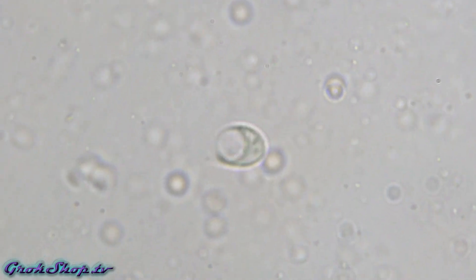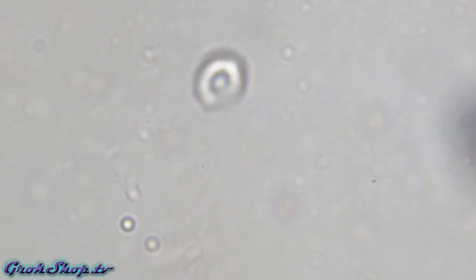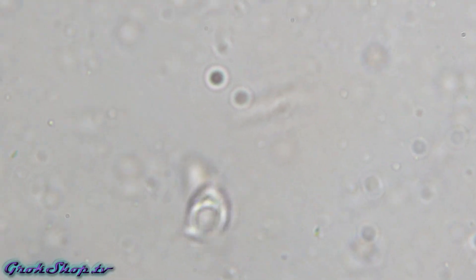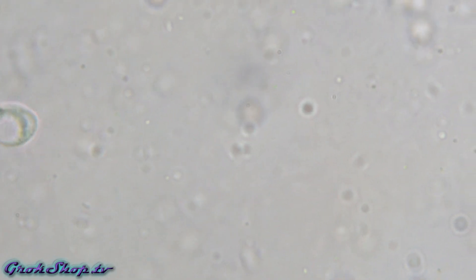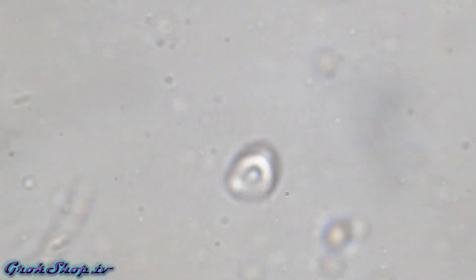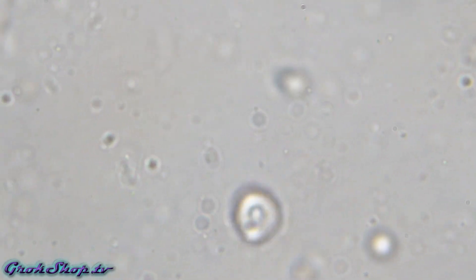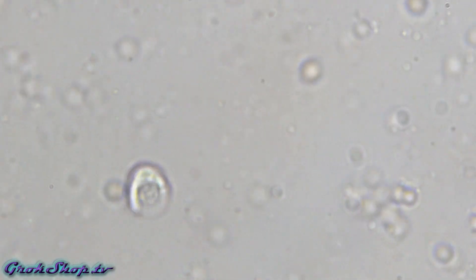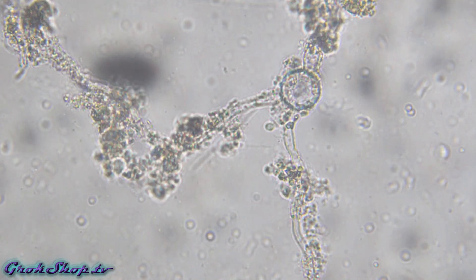This one's kind of new — got kind of a swimming bucket shape going on here. Anybody have an idea on this one, let me know. And finally we see a little more fungal hyphae.